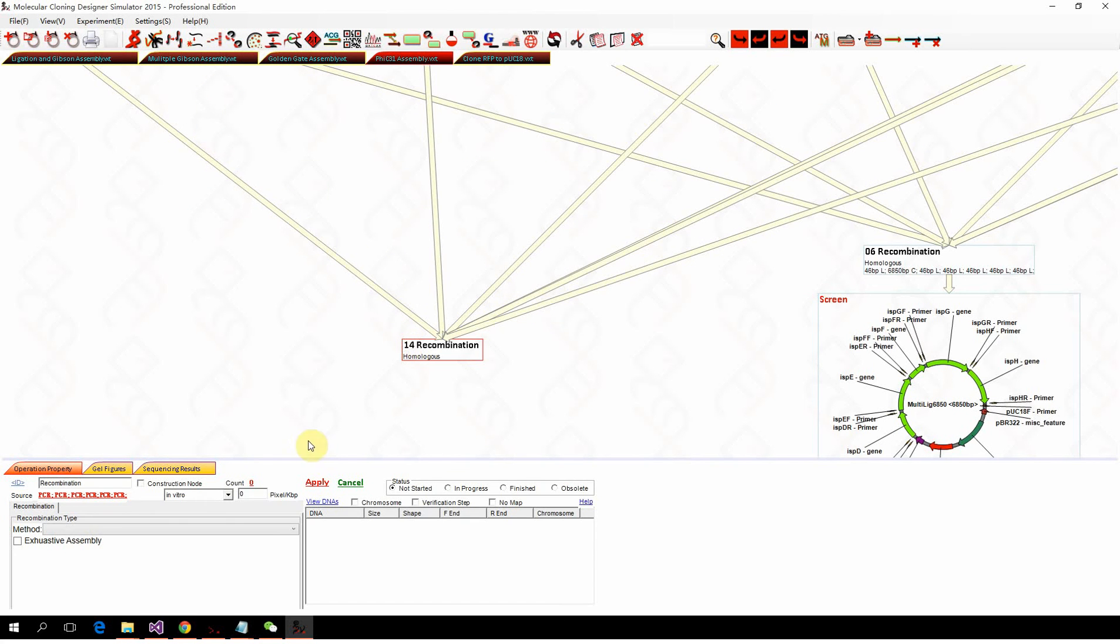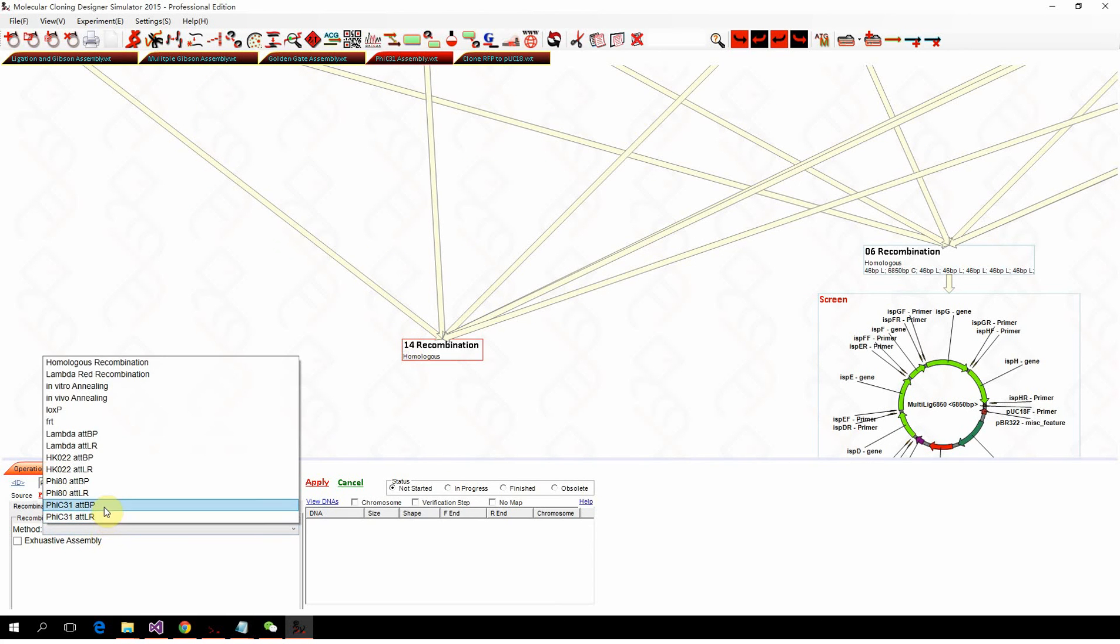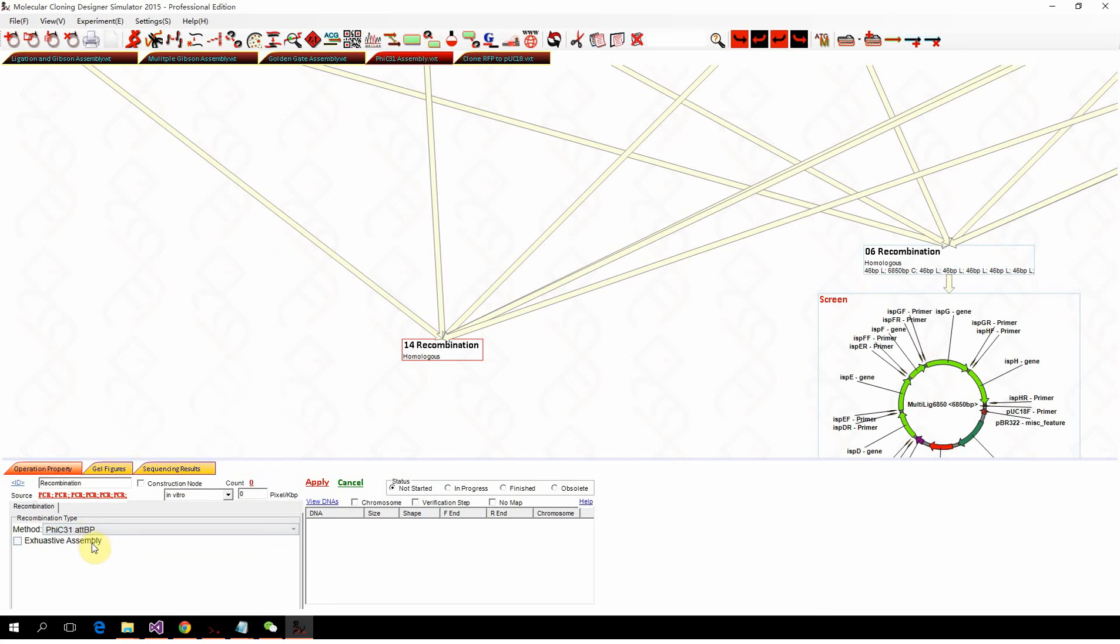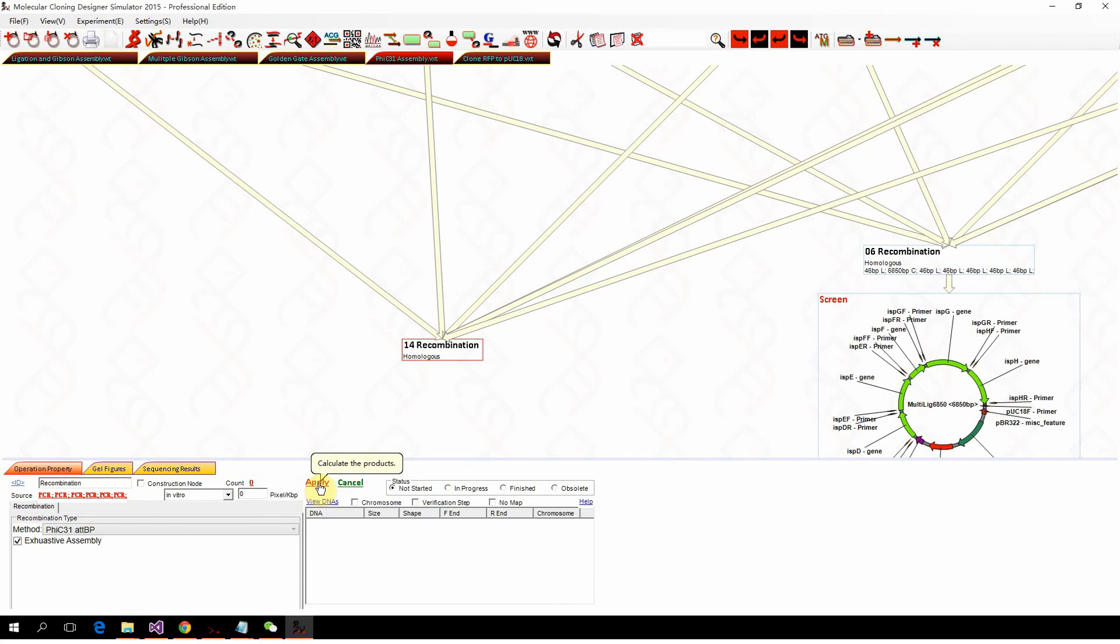We select all of them and do the recombination. Here we select the PhiC31 BP recombination, and also we need the exhaustive mode to assemble multiple fragments. Then we click apply.